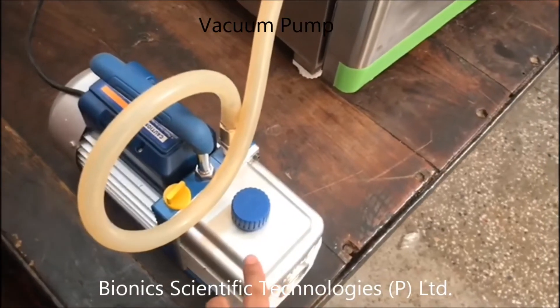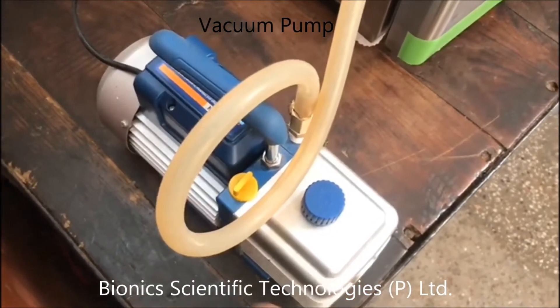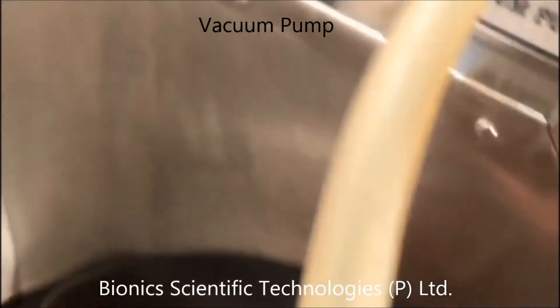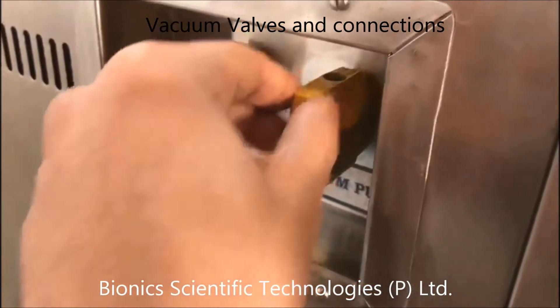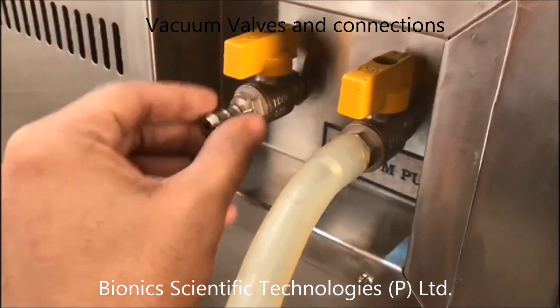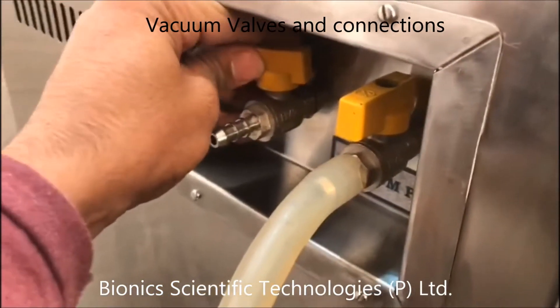This is the vacuum pump, and this is the pipe through which the vacuum is coming. Right now the vacuum is there, and you can release it like this.